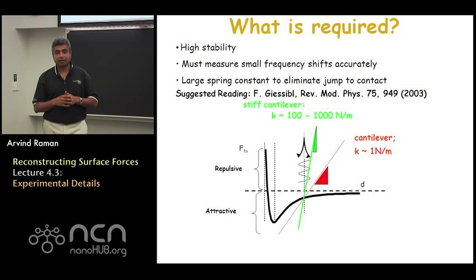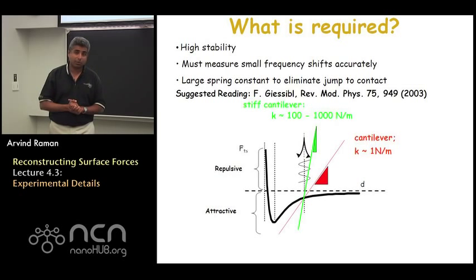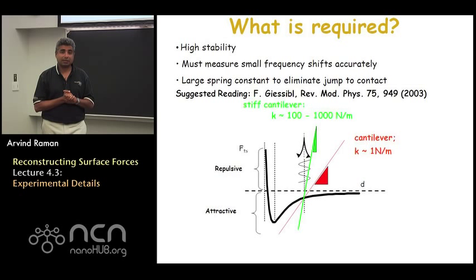And you recall that if the spring constant of the cantilever is larger than the gradient of tip-sample interaction forces in the entire range, in that case, at every z distance, there's going to be just one intersection between the constant slope stiffness line of the cantilever and the tip-sample interaction force, meaning that there would be basically no pull-in or snap-out kind of phenomena. Whereas when we choose a softer cantilever, which has a shallower slope, you can imagine that at some z distances, that shallower slope would intersect the interaction force curve at multiple points, allowing for multiple states where the tip is stuck or pulled away from the sample to exist. So all these are 3 basic requirements for doing frequency modulated AFM-based spectroscopy.